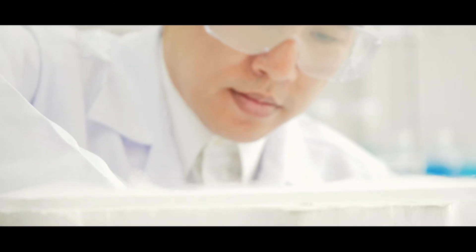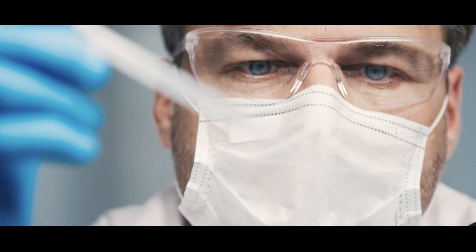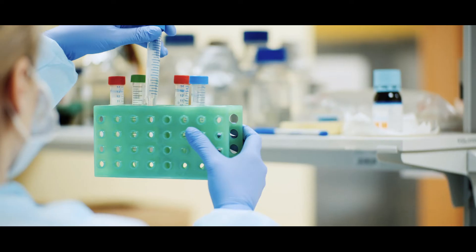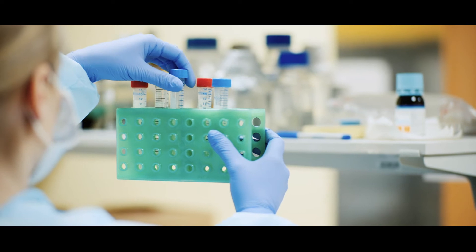At LabTag, we're proud to create products for life science professionals who work for humanity. Products that help them do their job.